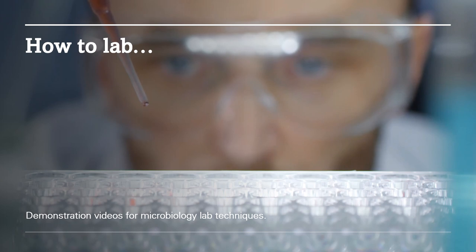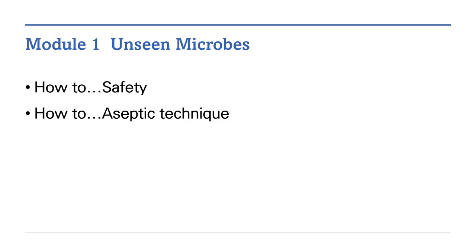Welcome to How to Lab. These are demonstration videos for microbiology lab techniques. Module 1: Unseen Microbes. How to Safety. How to Aseptic Technique.